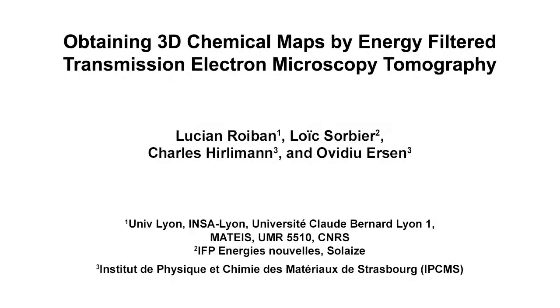The overall goal of this protocol is to obtain, visualize, and quantify the 3D chemical maps obtained by energy-filtered electron tomography. This method can help answer key questions in material science, chemistry, and catalysis fields, such as how the components of a given material are mixed at nanometric scale.